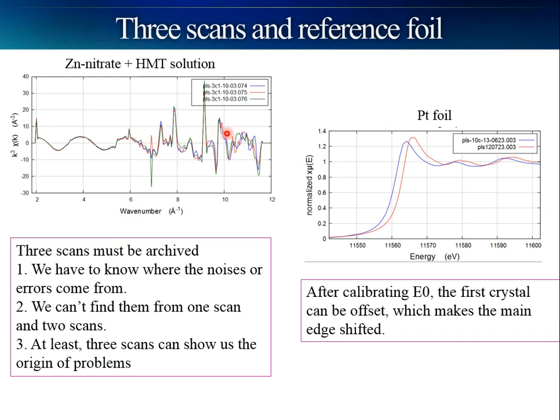So, what is the good EXAFS data? If you take just 1 scan or 2 scans, you are not able to find the answer to my question. When you take 3 scans, you can know where the noises or errors come from.